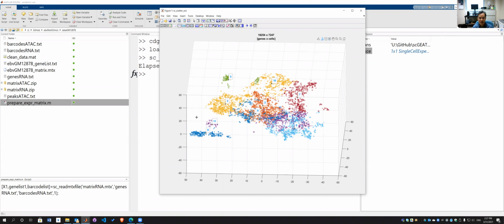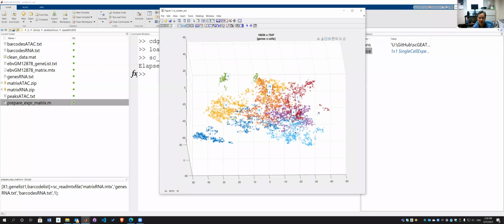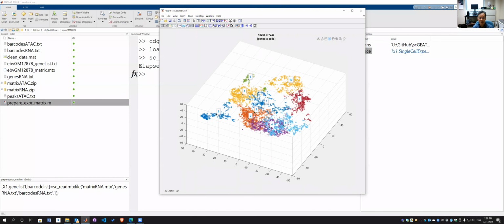Now I can select cells and merge these two groups, which use this button here. So I'm going to merge brushed cell into one cluster. And I select yes, and I will select what is target cluster. Now I want to select number 8. So the group 11 will be merged into group 8. Then update my class ID. So I'm done here. And I merged some of the cells from group 3, which was highlighted as the tip of this, into class 8 now. So that's some small adjustment you want to make.